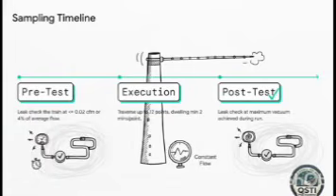Your entire sampling train cannot leak more than 0.02 cubic feet per minute or 4% of the average sample flow, whichever is less. Because think about it, a leak means you aren't pulling the exact volume of gas you think you are, which completely wrecks your constant flow rate and, by extension, your particle sizing. Once you're sealed up, you execute the test by traversing the stack.